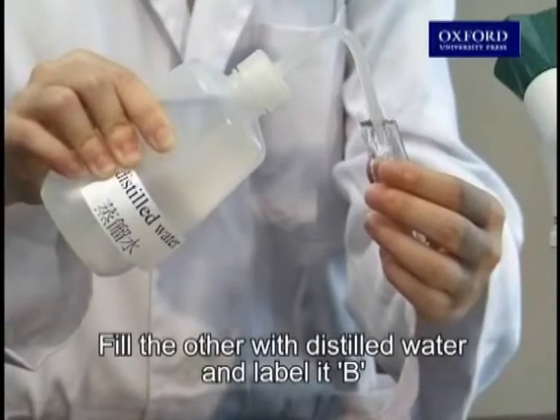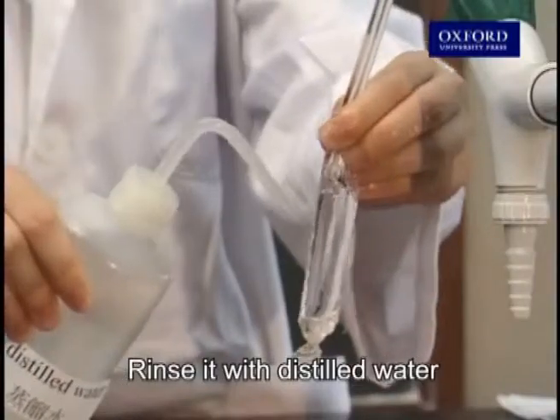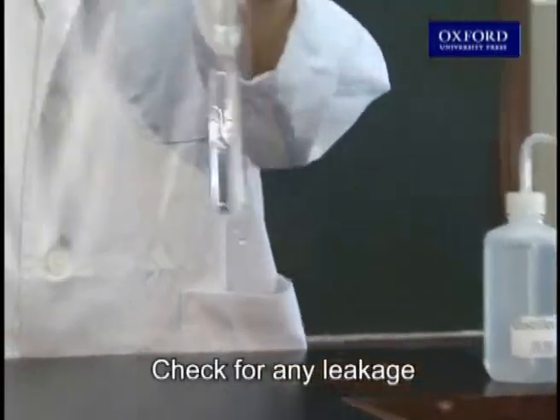Fill the other tubing with distilled water and label it B. Rinse it with distilled water. Check for any leakage.